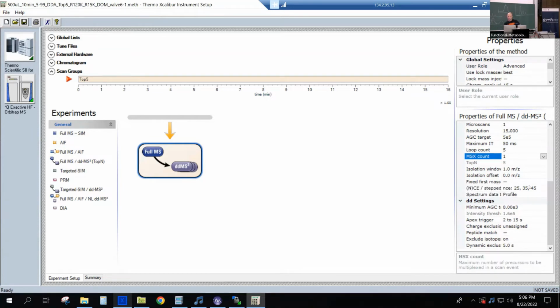Then, as I mentioned before, collision energy. We use NCE, that's normalized collision energy. And then I typically use this stepped collision energy here. That's for basically most of our metabolomics runs. Unless I have a very particular compound I'm looking for and I try to get a really nice looking fragmentation pattern for de novo structure elucidation, I just use that by default. That way I make sure my data remains comparable within data sets, right?